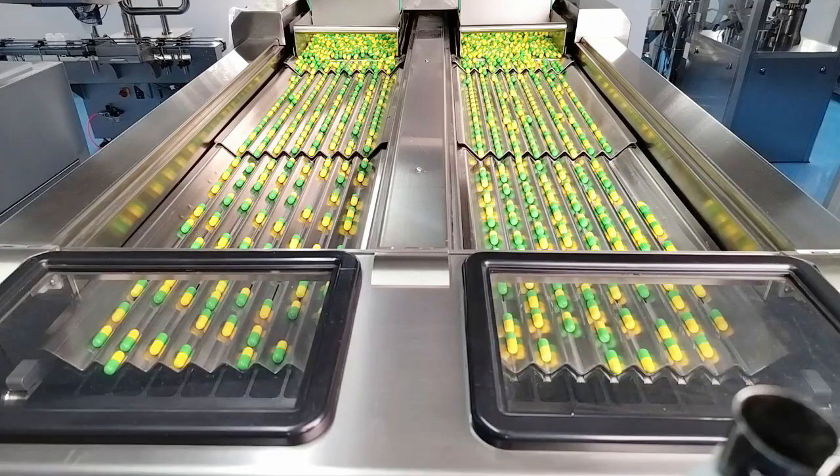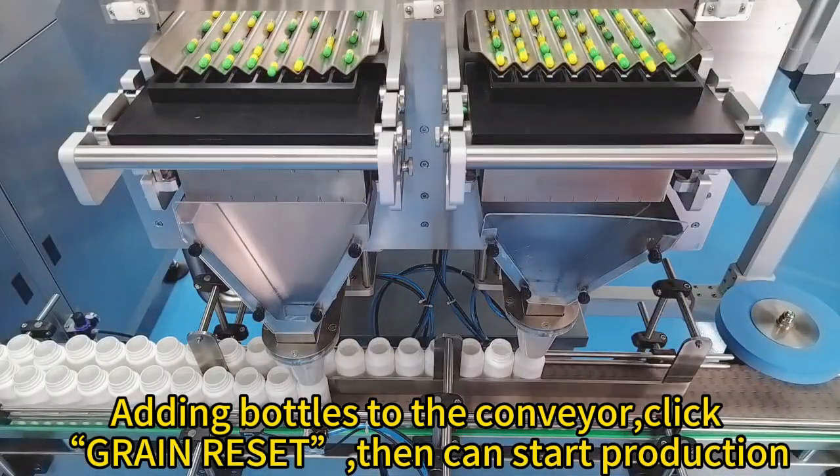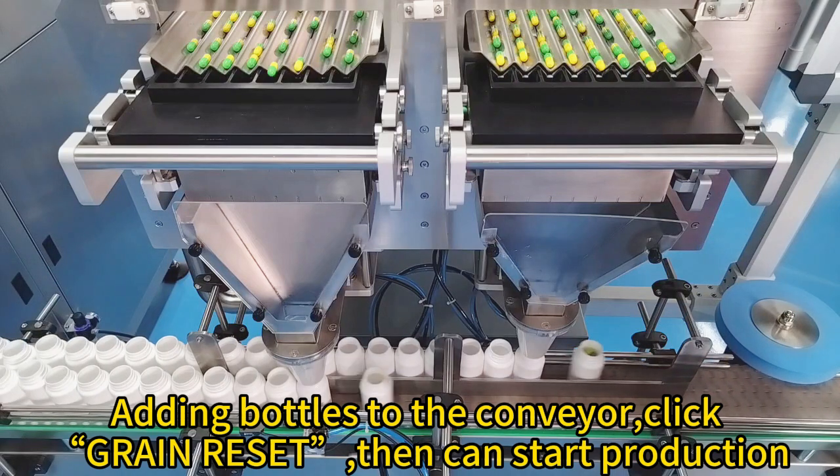Debugging completed. Add bottles to the conveyor, click green reset, then production can start.